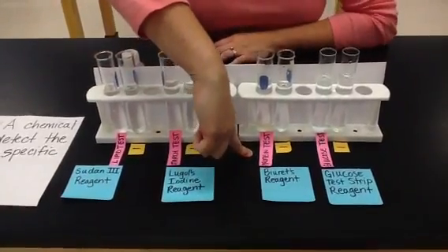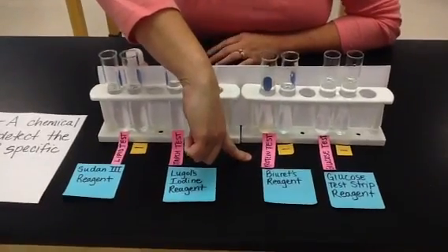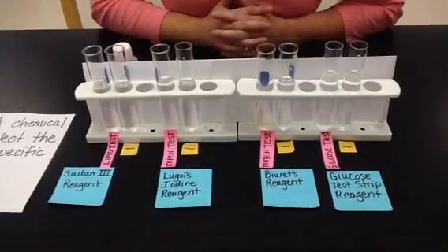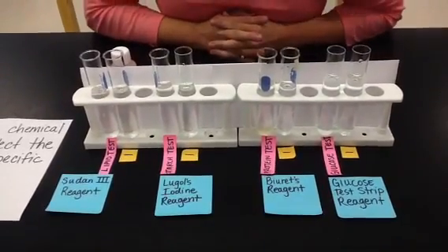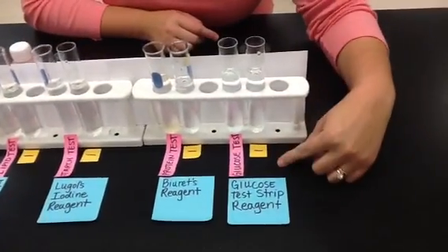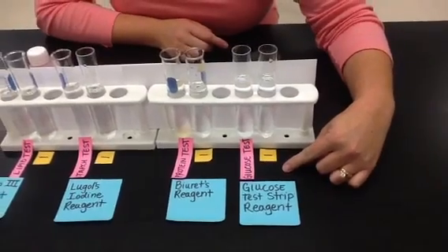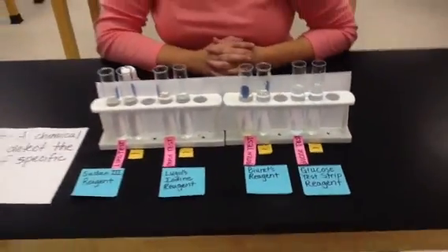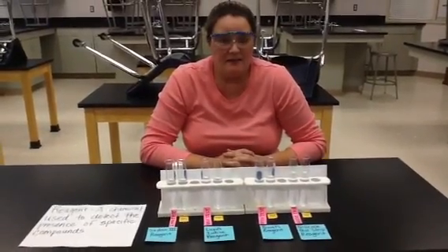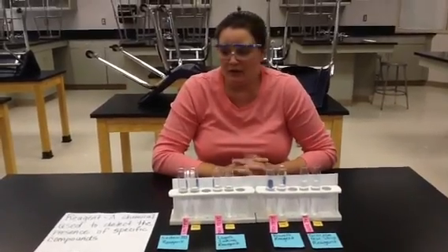So this is our protein test. Remember, this is another organic compound, and it is made up of amino acids, and amino acids are the monomers that make up our proteins. And then we have over here a glucose test, and remember that's a monosaccharide. It's very important in plants and animals and is also part of the carbohydrate family. You'll notice that we're not testing for DNA or nucleic acids at this point, just because it's a little harder test for us to do. So we're going to focus on these molecules at this time.